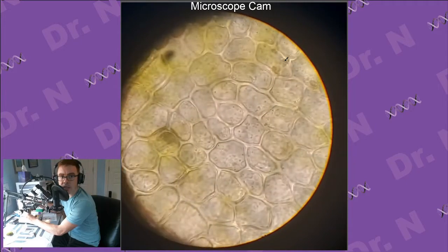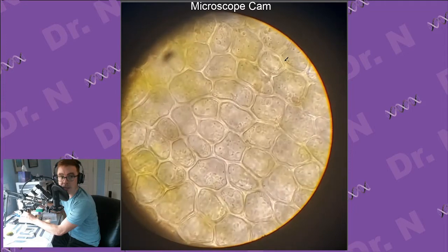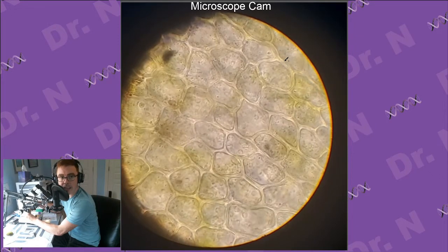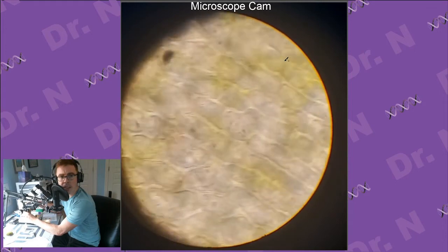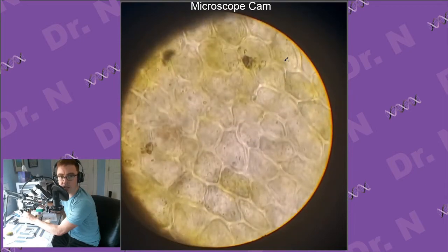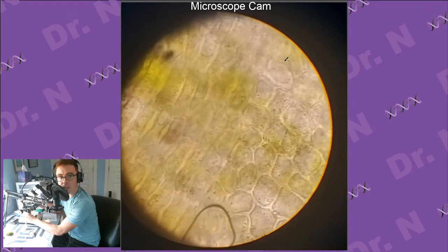Okay, so anyways, I think moss is a non-vascular plant, so that means it doesn't have vasculature, unsurprisingly. That's why they're always so small and low to the ground, and usually in a wet area. It's because they don't have a great way of transporting water throughout themselves. Whatever I picked up had these little green spheres on top, and that's what I just picked up and squashed down. Whatever those spheres are, I don't know if they're a reproductive organ of some kind.